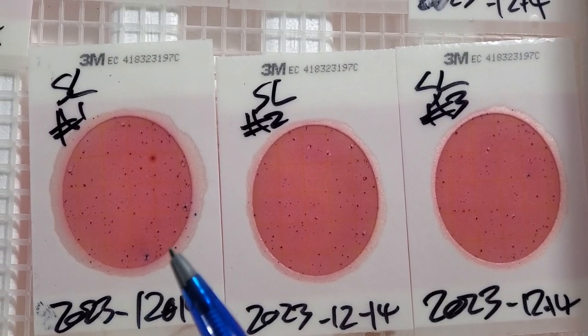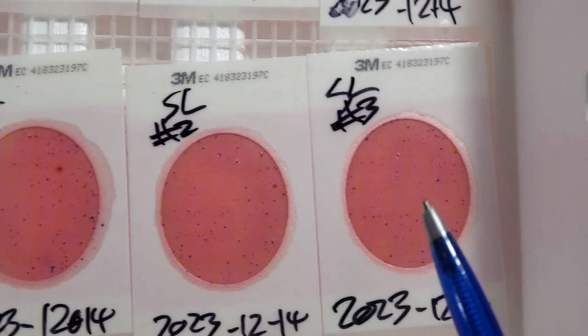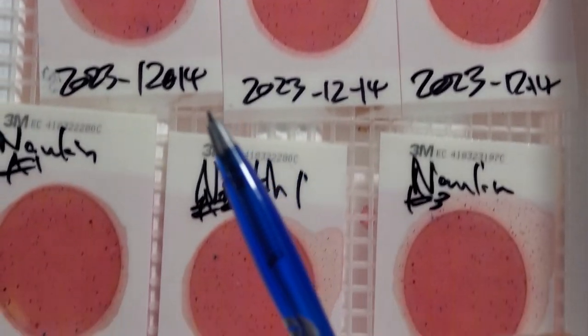Down at state line, we got two, one, two — we got nothing in one — and over here there's one. So that's two, zero, one, which is also 100 CFU.